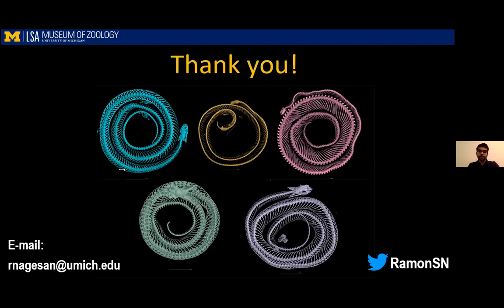With fluid preserved specimens, we're always worried about desiccation, and the staining process that we currently employ takes the specimens out of alcohol and puts them into water for staining. And so there can, of course, be some desiccation to the specimen. It looks like they generally return back to good shape, like they kind of plump back up once they go through the destaining process.